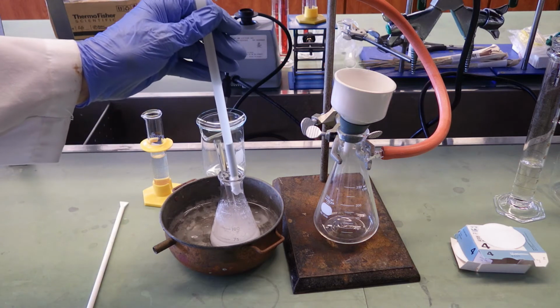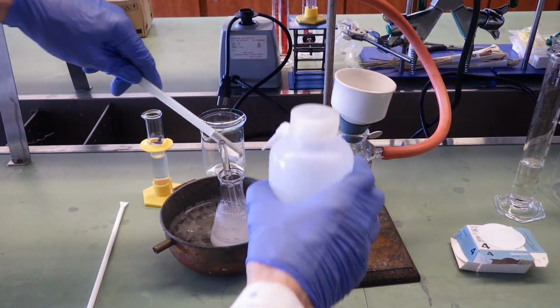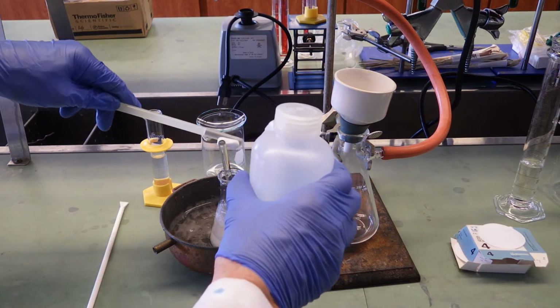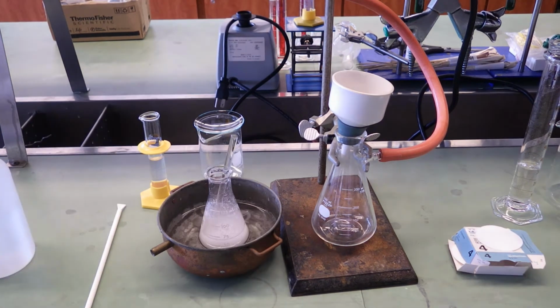Let's recover that mag stir bar. I should have really taken it out before crystallizing. I notice I have some ASA on it. I'll try and rinse it off, but it doesn't want to come off, so we'll catch that later during the recrystallization.